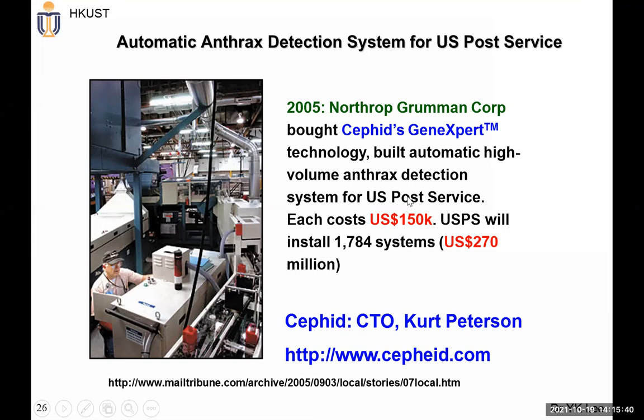Actually, I recently also started a new project to see how we can come up with an even newer idea, not using the micro heater, but using a new plasmonic way to do plasmonic PCR. You can do rapid thermal cycling in about 5 minutes.